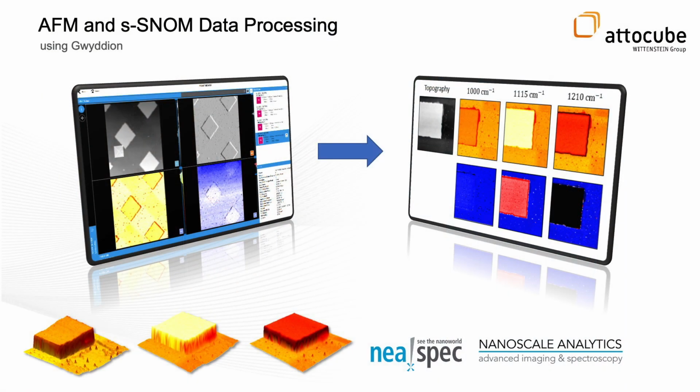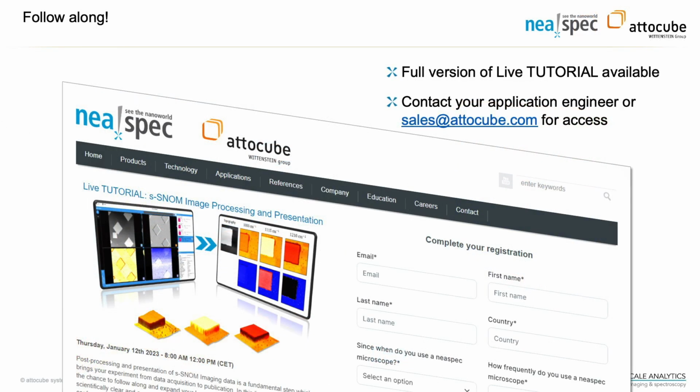Actually, this is not the first time that we're doing such a Gwyddion tutorial, but there's a really long, full version on our website, which is a few hours. You can speed it up in the boring parts, stop it in the difficult parts, and really follow along. On the website, you can download some test data, so you will get exactly the same data that's in the webinar, and hopefully get to the same result.